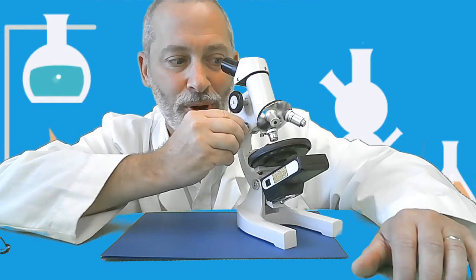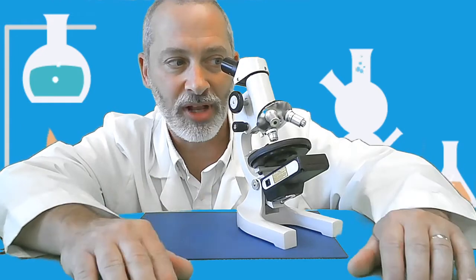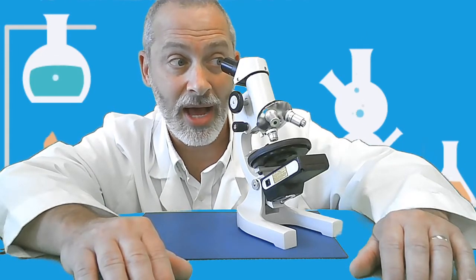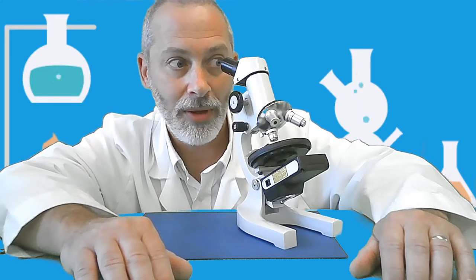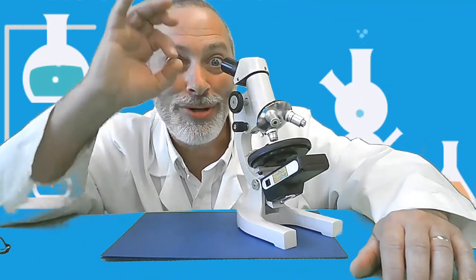Oh, now it's perfectly in focus. I can see it perfectly clear right now, again, with both eyes open. My dominant eye looking and my non-dominant eye free to look around and look at you. Why does it feel like somebody's watching you?